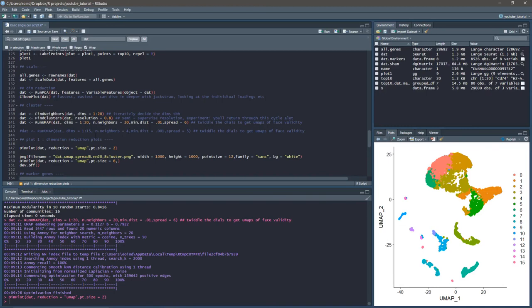I just wanted to get it up and running, quickly smash through, and then the real learning I found occurs when you start going back, iterating through, lifting up the hood and seeing how the various algorithms and functions tick, and what you can change, what you can push and what breaks them. This is the simplest way to run through a single cell workflow.